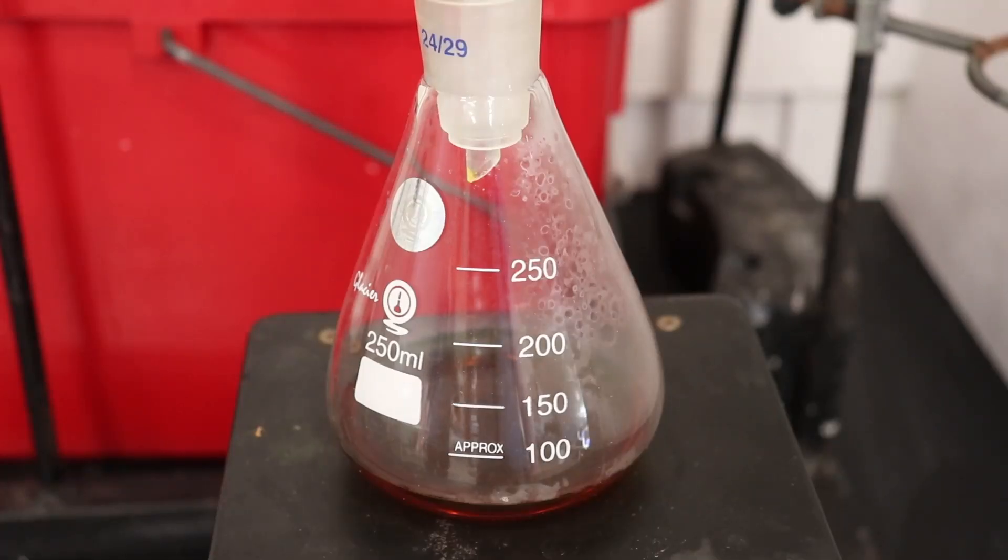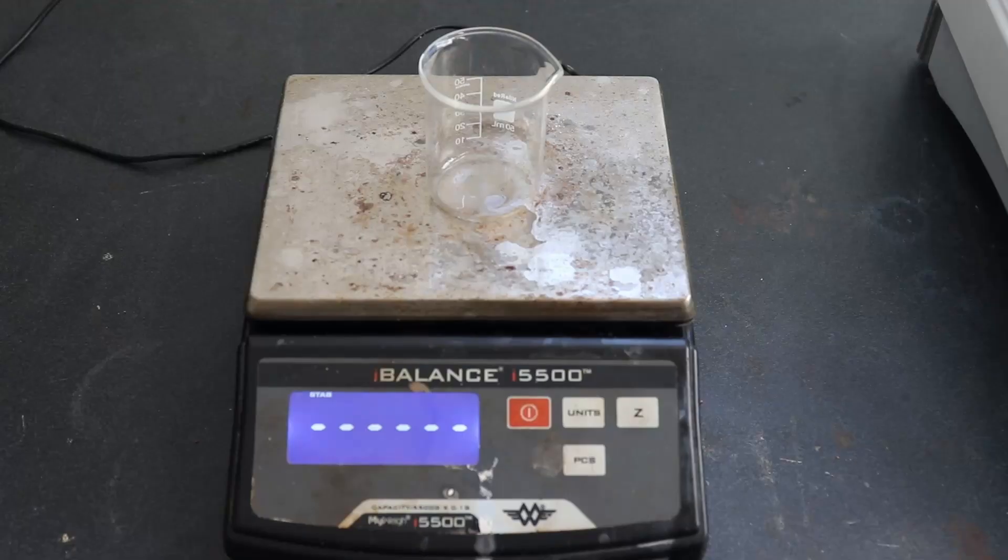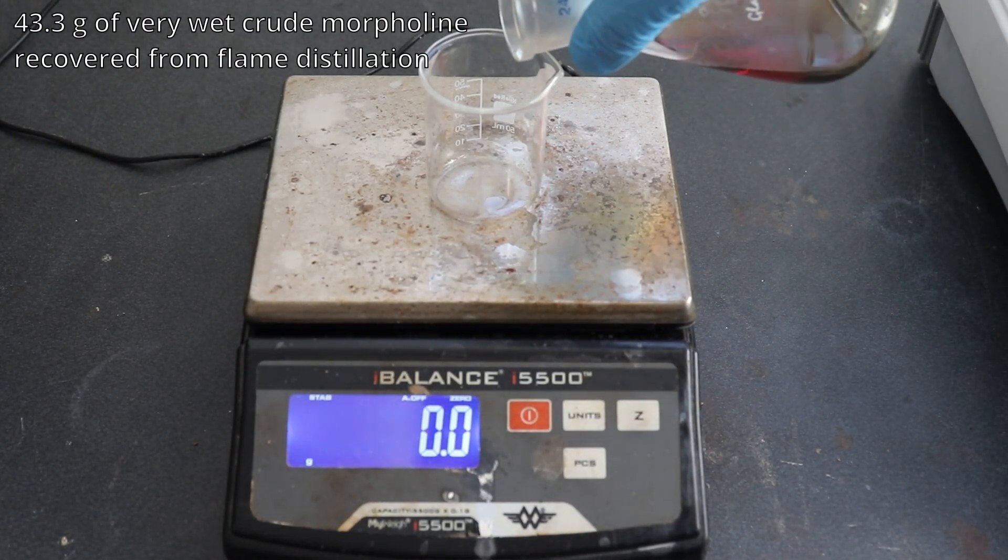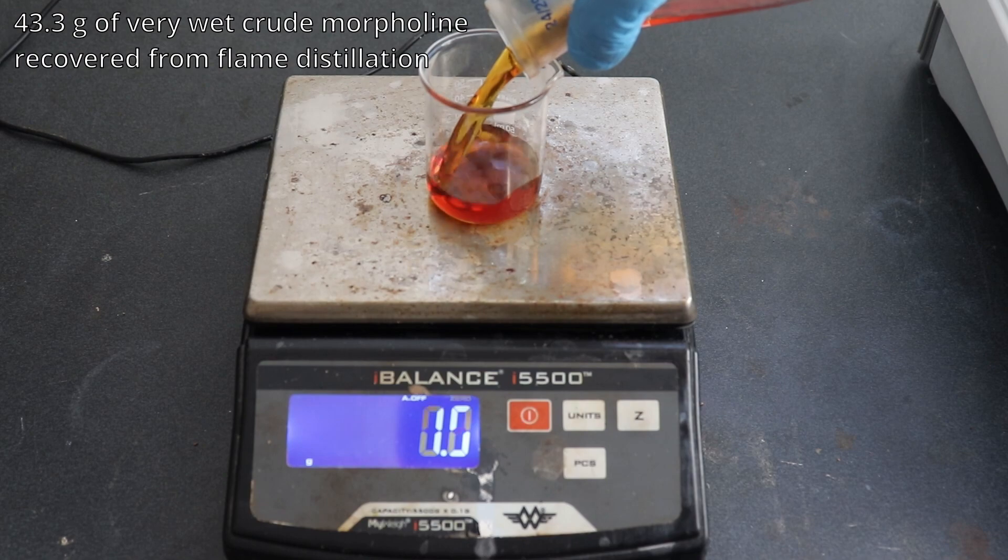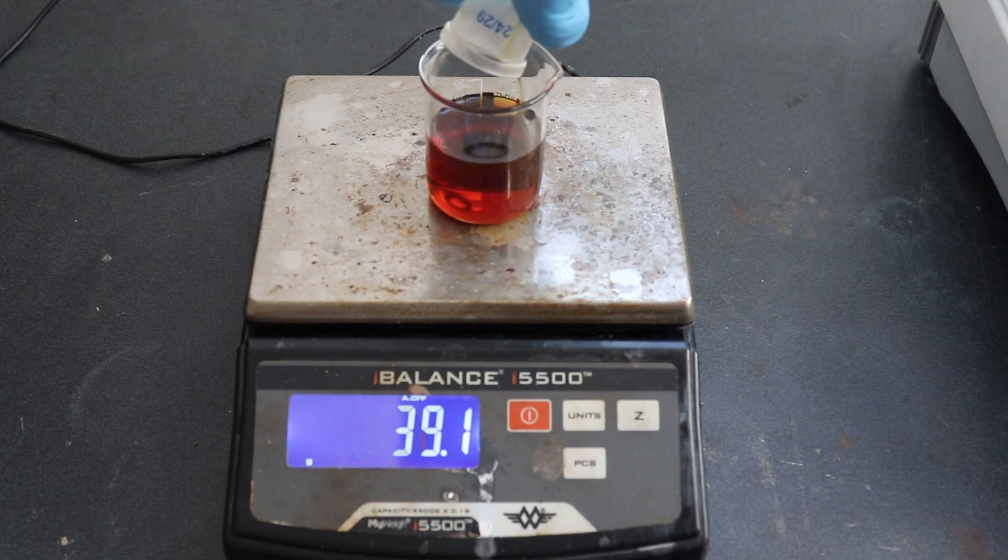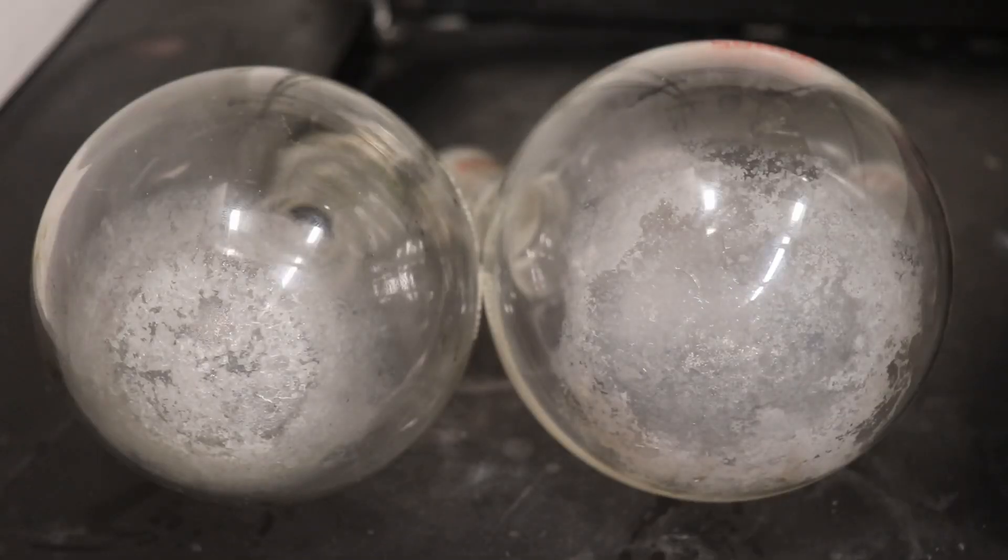43.3 grams of the free-flowing dark amber distillate was collected, which possessed a painfully sharp burnt fishy odor. The high temperature with the calcium oxide irreparably damaged the flask and led to microfractures in the glass, so expect to be sacrificing a flask if you attempt this synthesis.